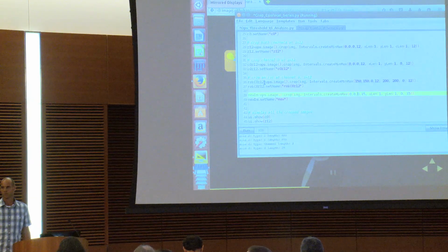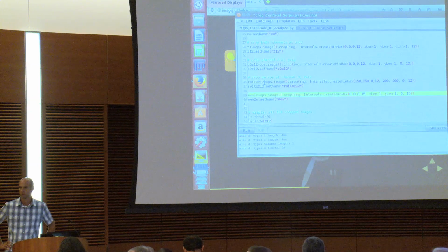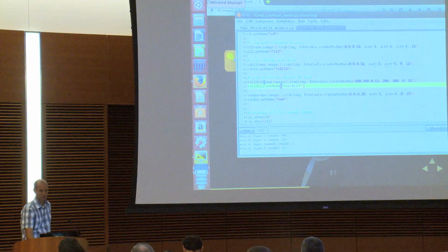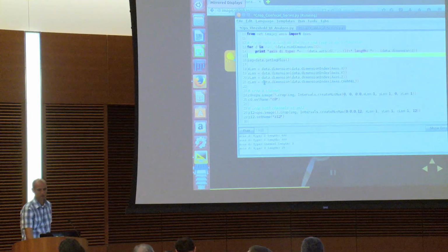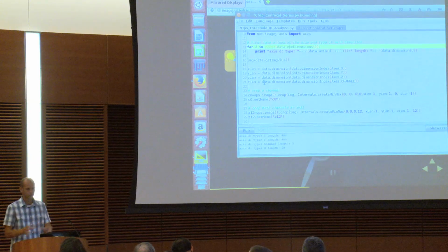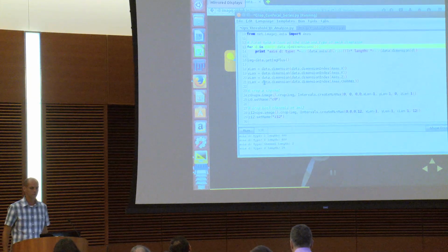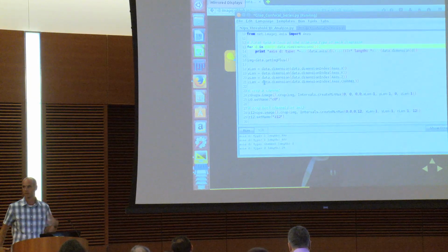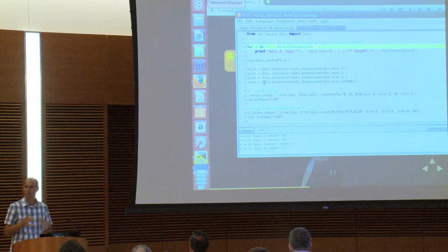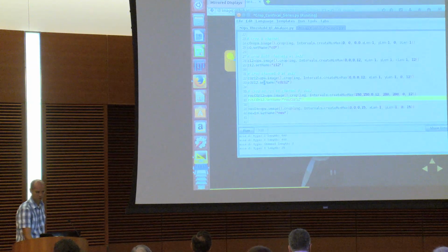For example, we could generalize this. Right now, the current code crops -1 on all dimensions, but it would be harder to understand. There's that intervals thing in there. So this little loop here that just printed the data, instead of printing the data, you could use it to create your intervals. You have the number of dimensions, and you have the indexes as the dimensions and stuff like that. So you could create a fancy loop that's very n-dimensional, robust.